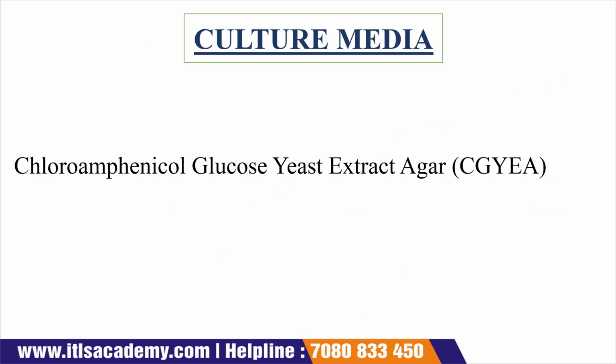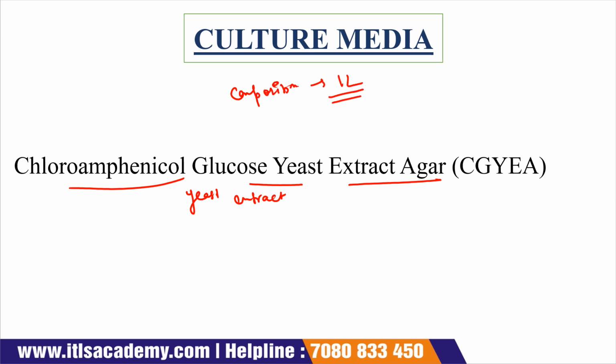Now the next is the culture medium. Here we are using chloramphenicol glucose yeast extract agar, and this is the composition of the medium, for 1 liter. The amount of yeast extract is 5 grams per liter. We also take glucose, and the amount of glucose is around 20 grams per liter.